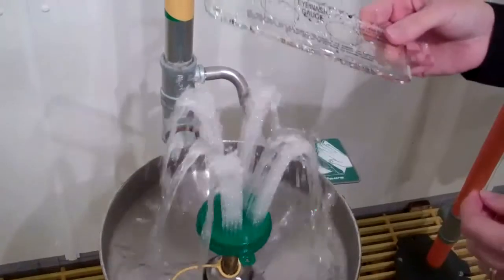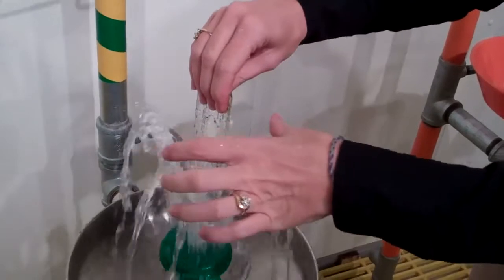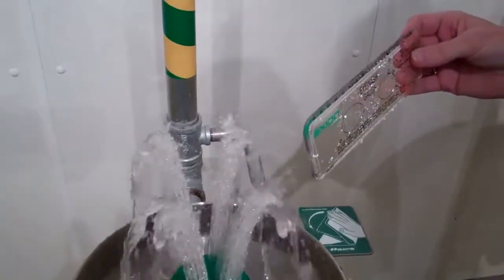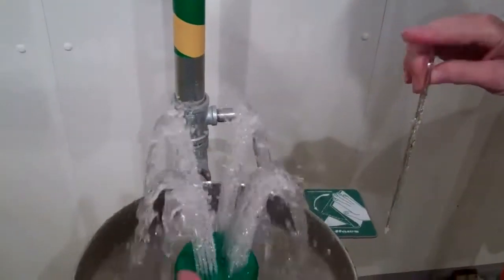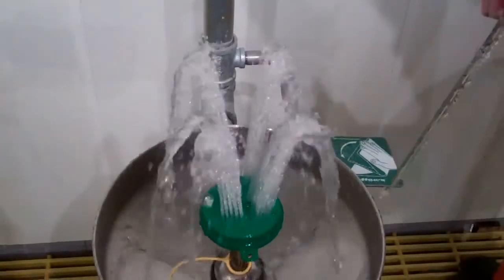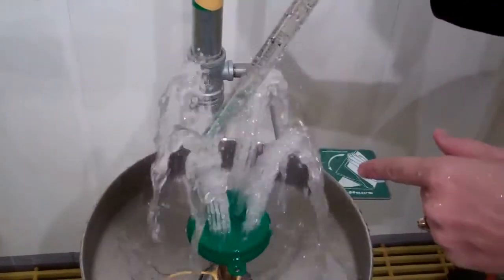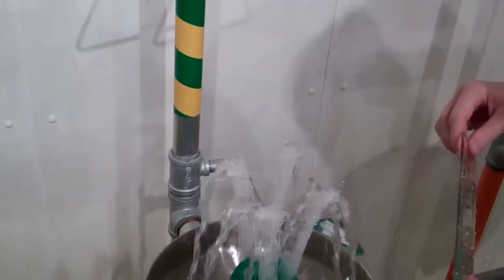The eyewash gauge on typical eyewashes is also used to separate the water flow so that you make sure that your flows on either side are good. With the new Axian MSR, because we have the inverted flow, it's going to drench you from the inside out. You don't have to worry about that — you're not going to have any one side overpowering the other. So that's a great feature about the Axian unit.